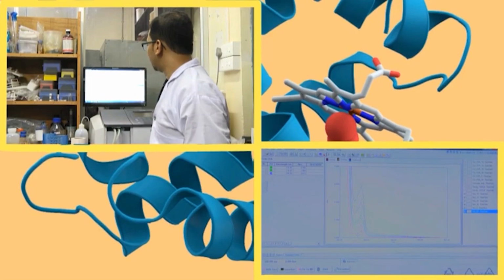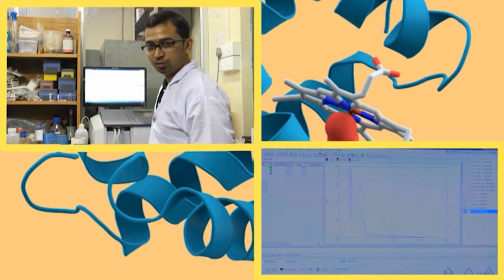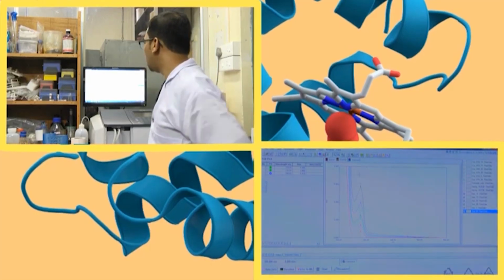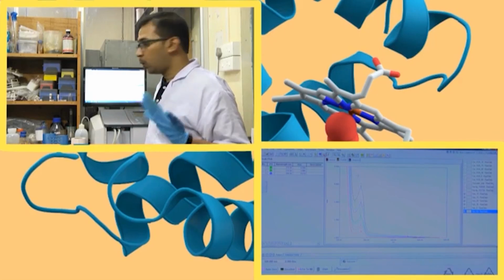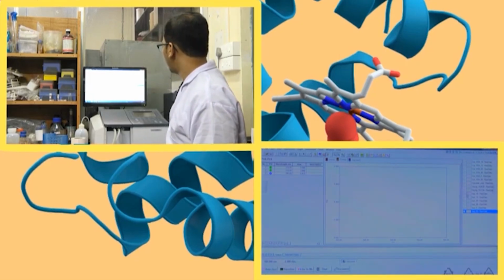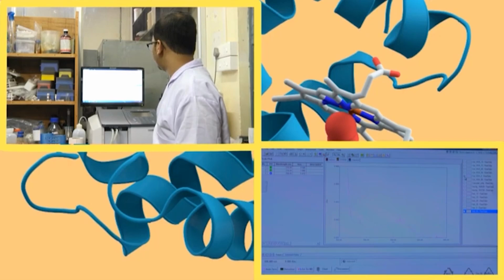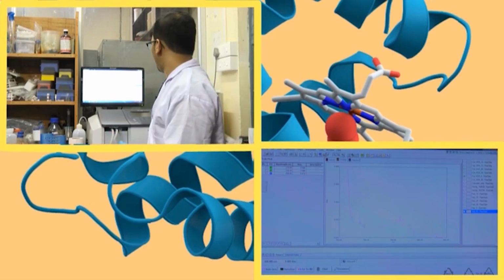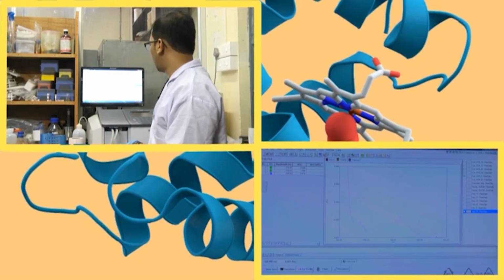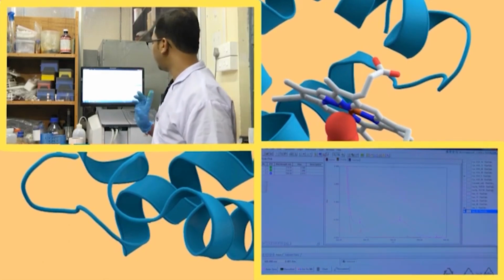Here we can see this interesting spectra: with increasing concentration of HSA, we are getting an increasing value of the absorbance. Now, these are controls. What we need to do is subtract. Let us first disable all this. From what we have saved, we will take curcumin plus HSA with 5 microliter of HSA, and only 5 microliter of HSA.